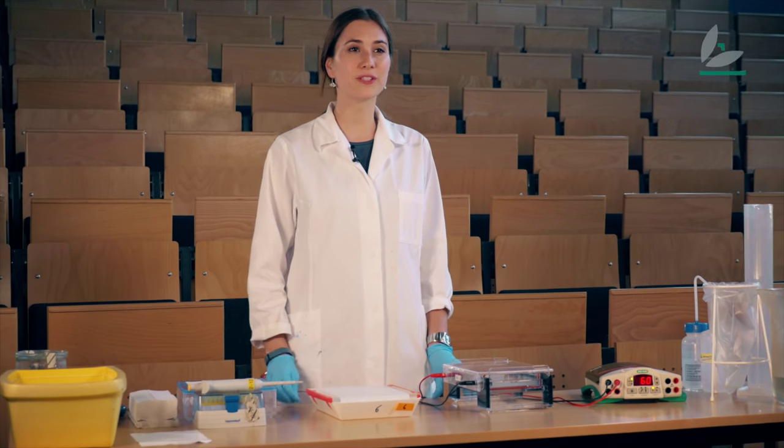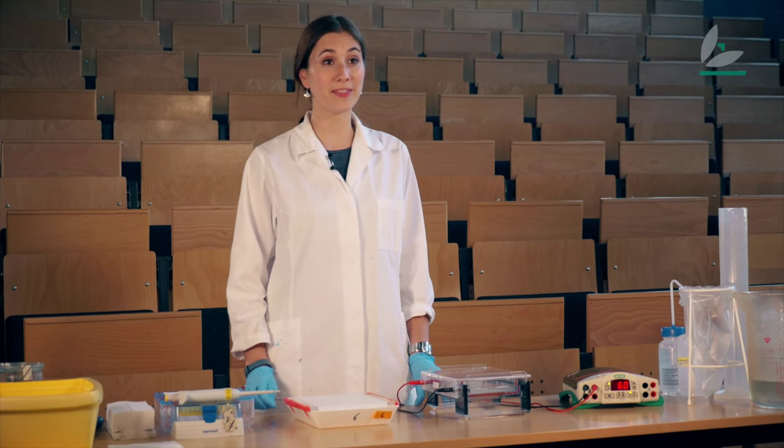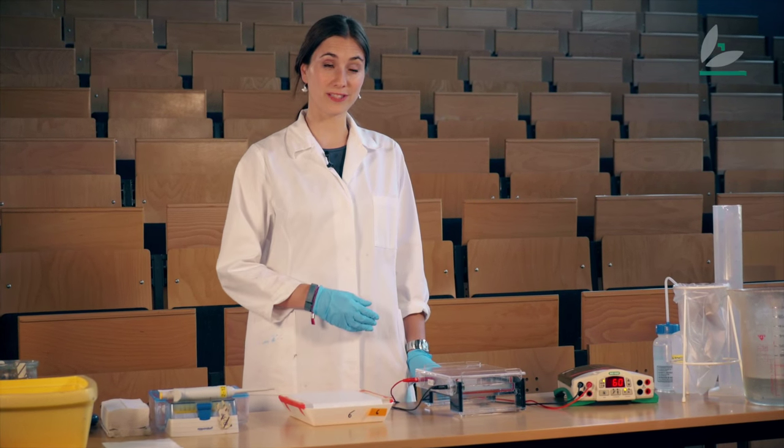To do so, I have to first separate the DNA fragments by their size on a gel electrophoresis. How a gel electrophoresis works I've already explained in the film Gel Electrophoresis.